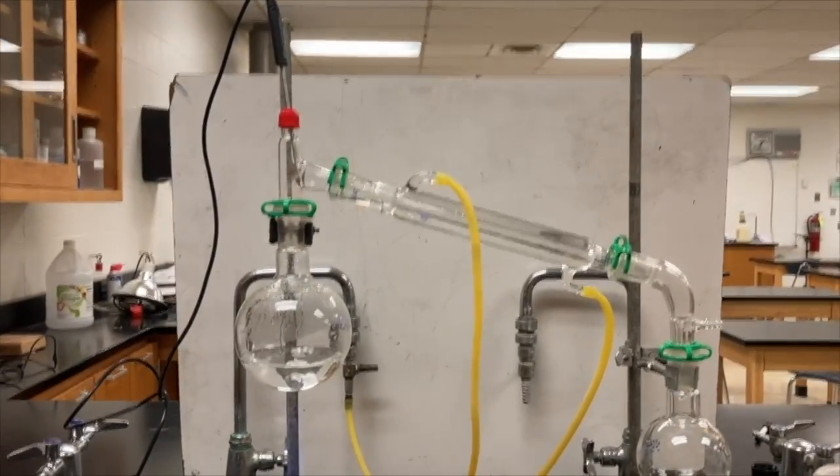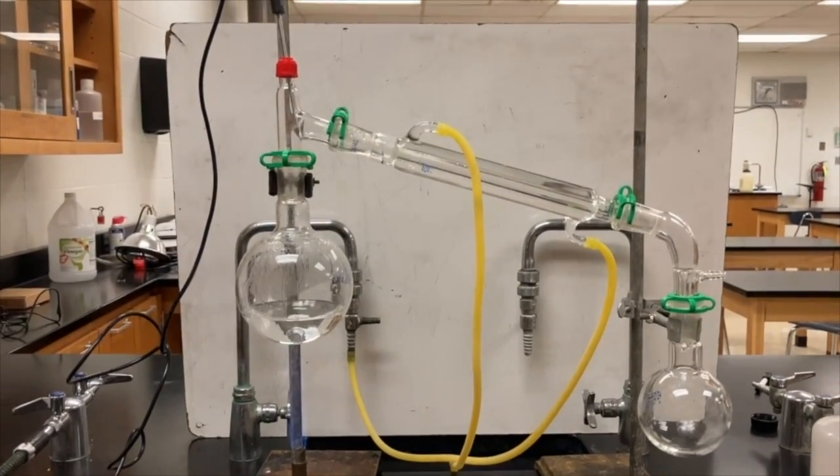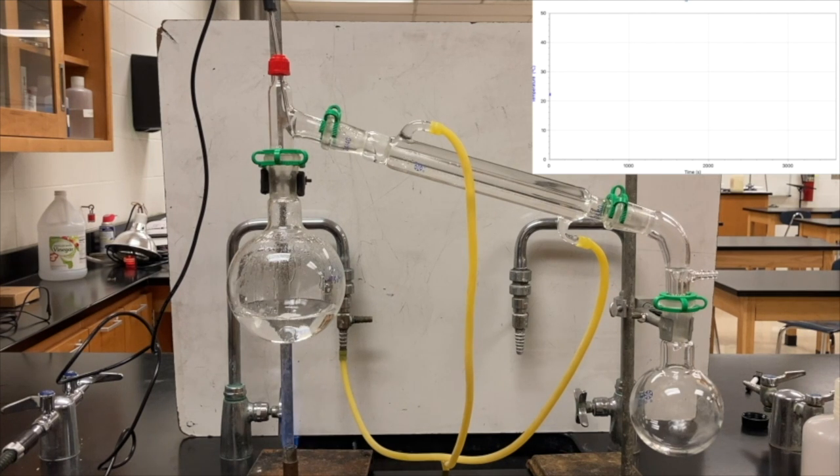So now we're beginning to see a little bit of movement. If you look carefully, you can see the water beginning to move a little bit from energy heating. So here's the screen. Zooming in on the screen, you can see that the starting temperature is just a little above 20 degrees. That's room temperature, approximately.